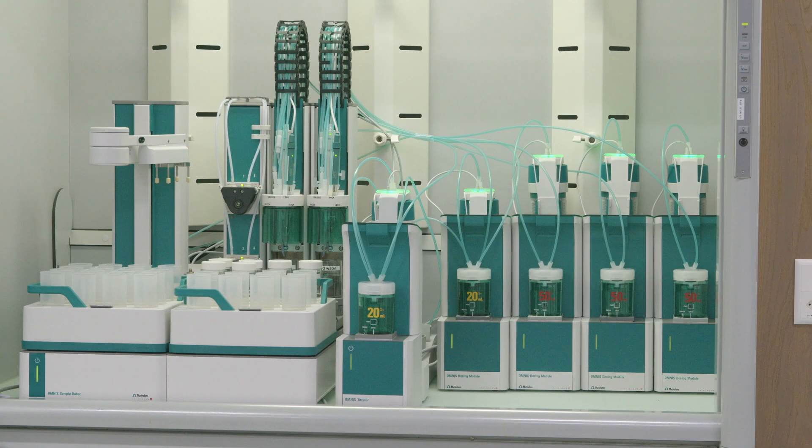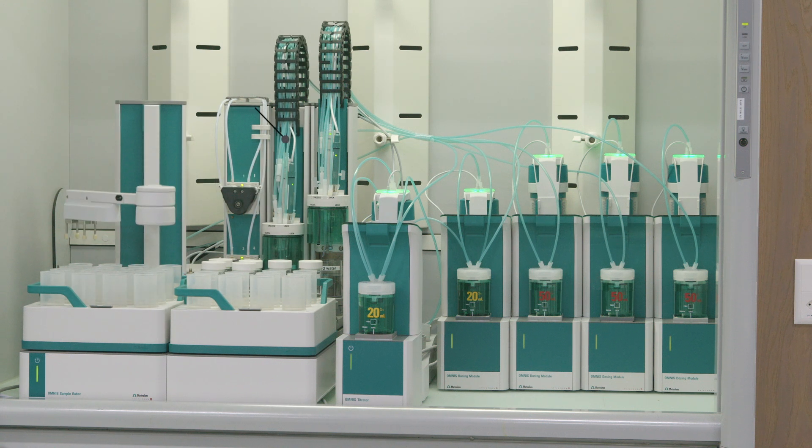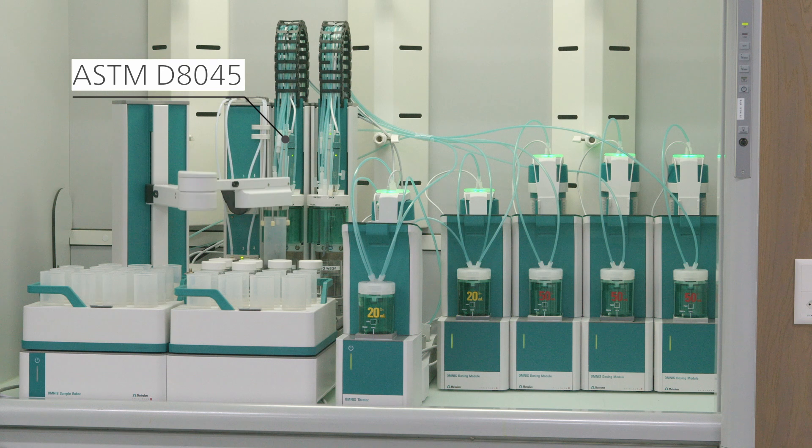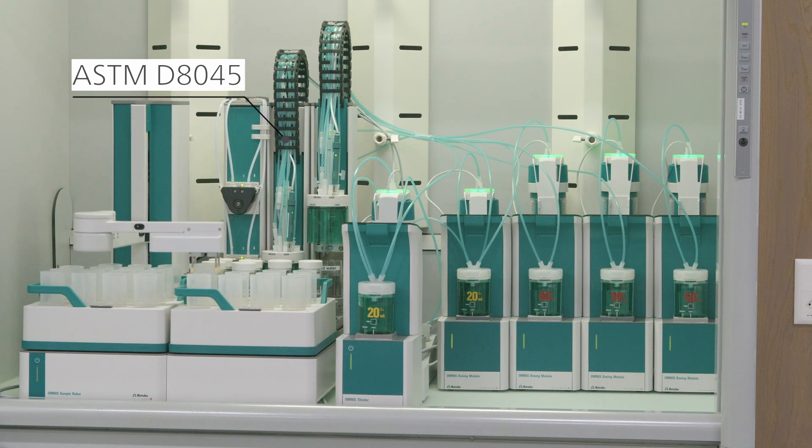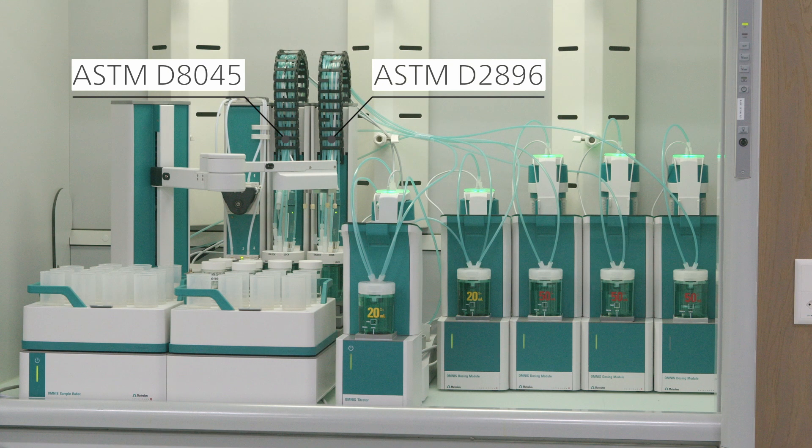If you have a high sample throughput, you can automate your system with an omni-sample robot. On one workstation, you can determine the acid number thermometrically according to ASTM D8045, and on the second workstation, the base number can be determined potentiometrically according to ASTM D2896.